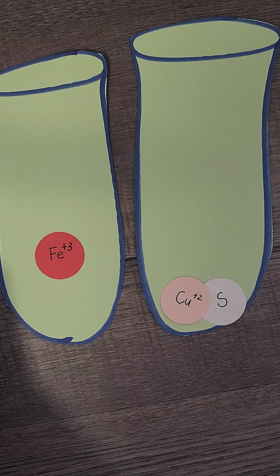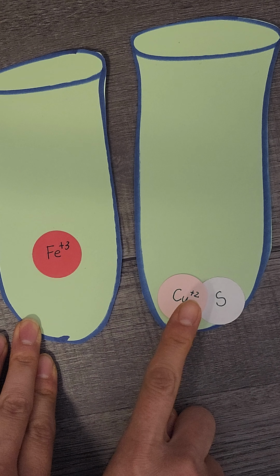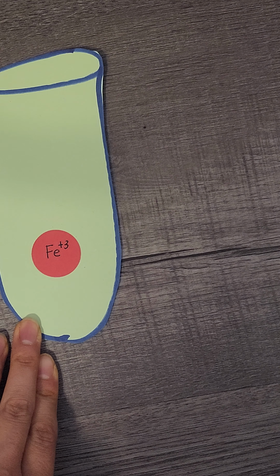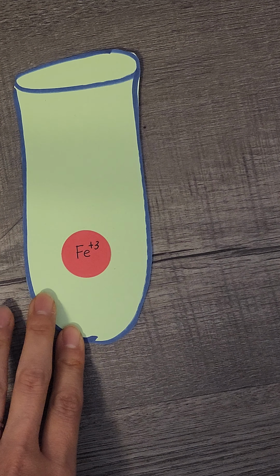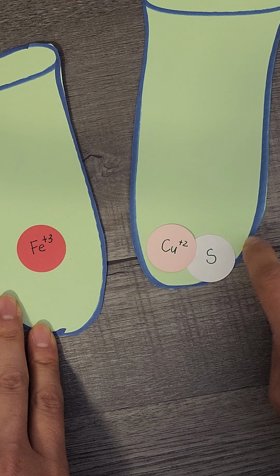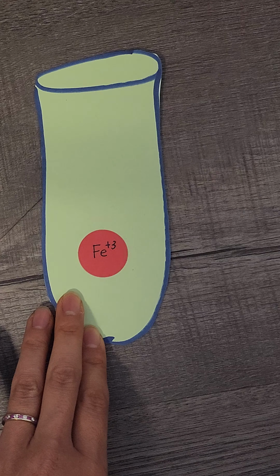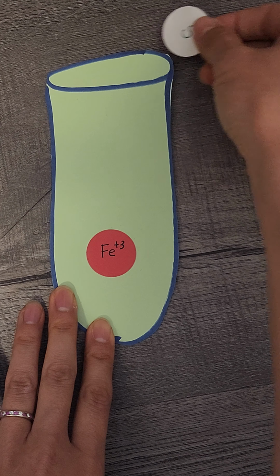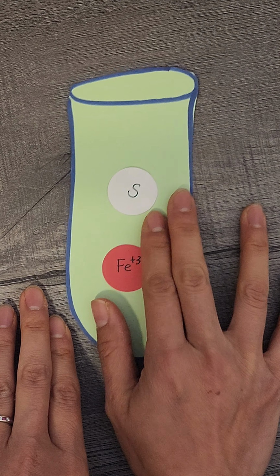All right, now that you have this iron, I'm going to leave the copper sulfide to the side. Then for this one, you're going to add, by the way, you do need to observe this and take pictures. You're going to add another layer, about 5 drops of thioacetamide into the solution. Then you're going to heat this up as well.